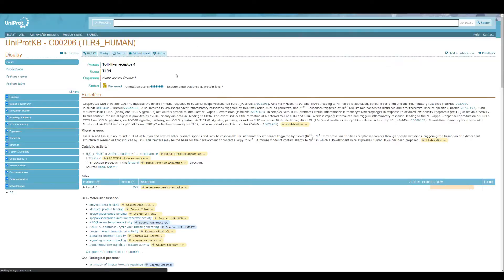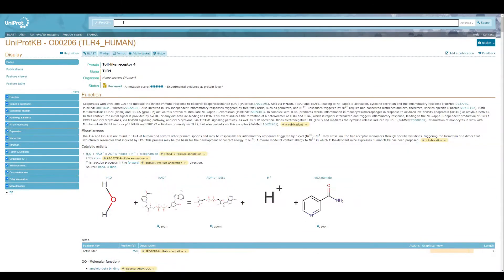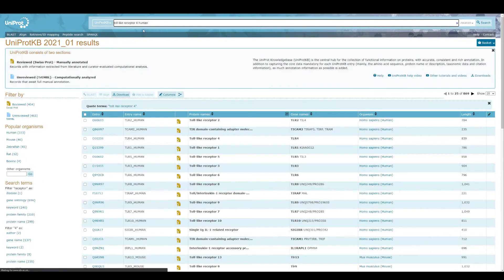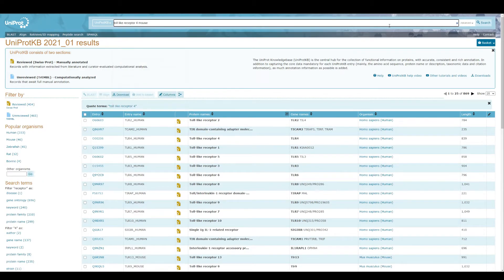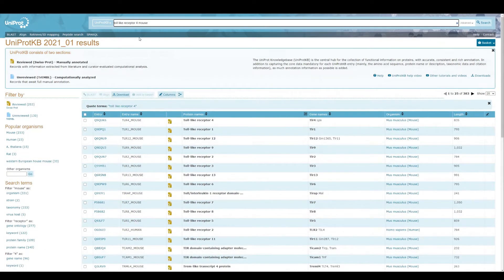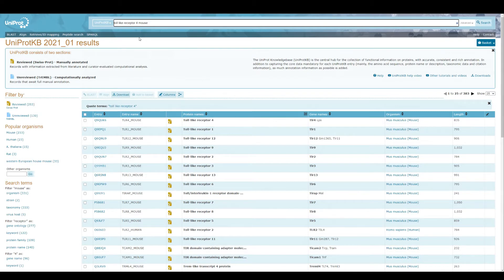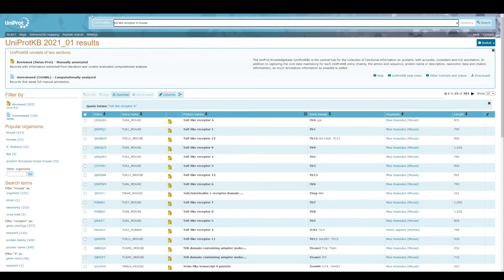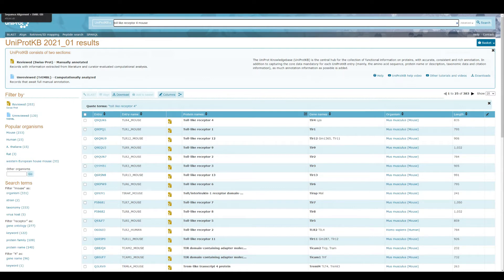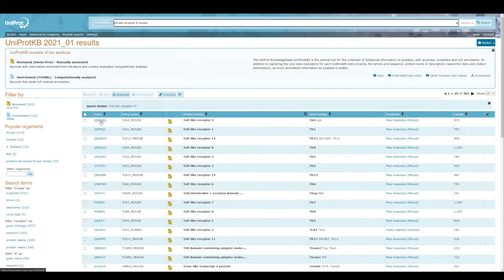Now the second protein that I'm going to use is the toll-like receptor 4 for mouse. So I'm using one protein that is for humans and one for mouse, and I'm going to align these two protein sequences. We're going to see how many amino acids are the same and how many amino acids are different.